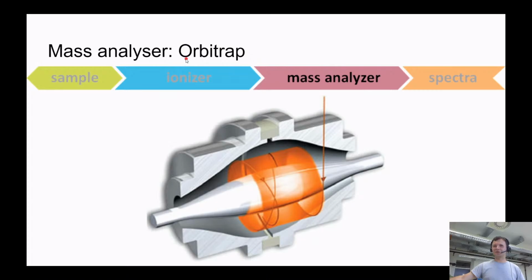But now I think we're in a very good position, because we have a competition of two companies providing different mass analyzers. One of the main companies is Bruker, and the other is Thermo Fisher. Thermo Fisher does a lot at the level of Orbitrap. Right now there is a big internal competition happening between two approaches, and the ones who gain the most advantage, of course, are the users.